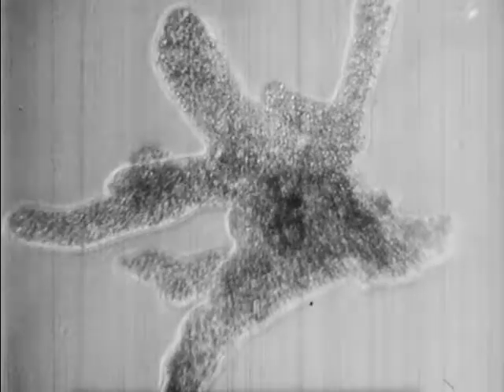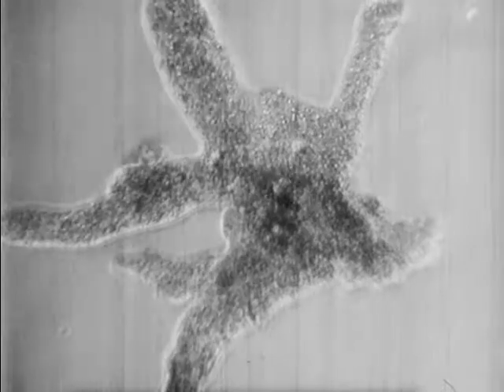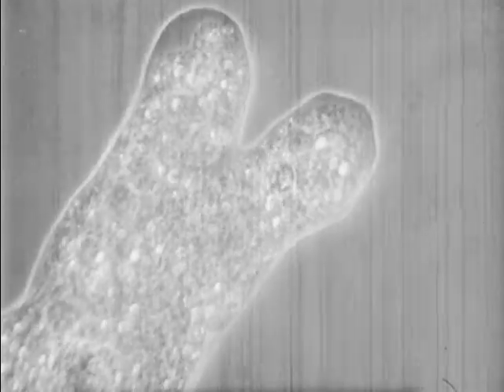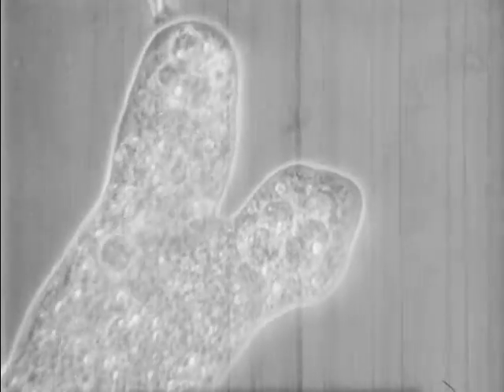This animal is an amoeba. How does it move? What does this movement do to its shape? This part of the amoeba is called a false foot. As it flows, the amoeba is always ready to capture food.